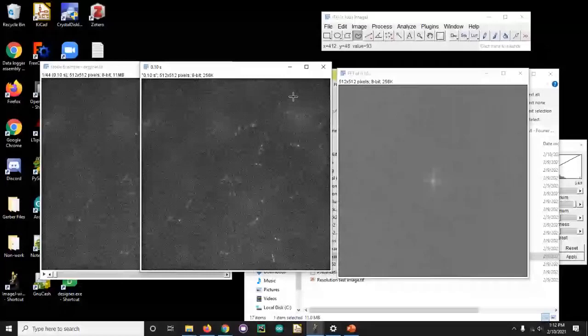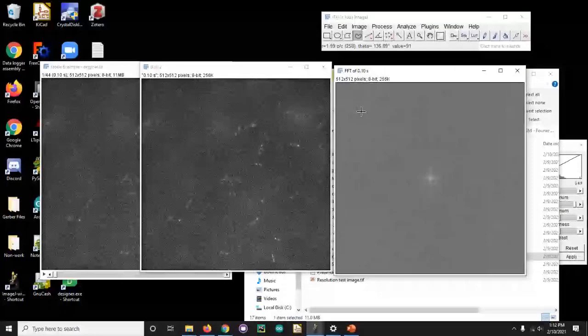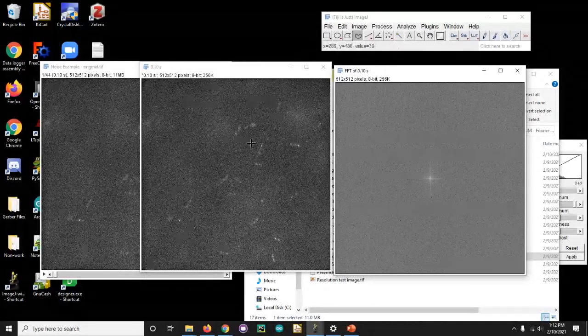And so the safest thing to do is to rely on the fact that a single point in the Fourier transform corresponds to a sine wave going all the way across your image in that direction. So one point in the Fourier transform corresponds to all positions in the image. It's the frequencies that contribute to all those positions. And correspondingly, for one point in the image, it takes the entire Fourier transform to back calculate, right?